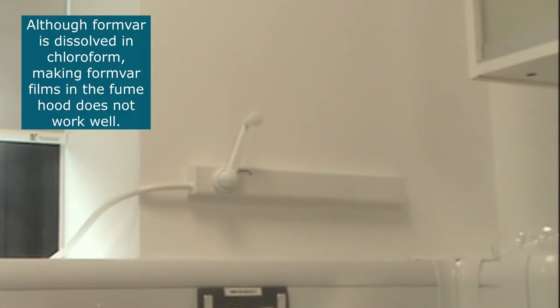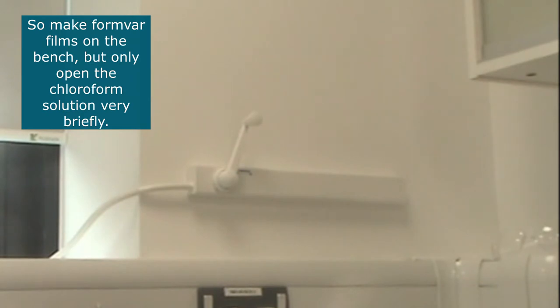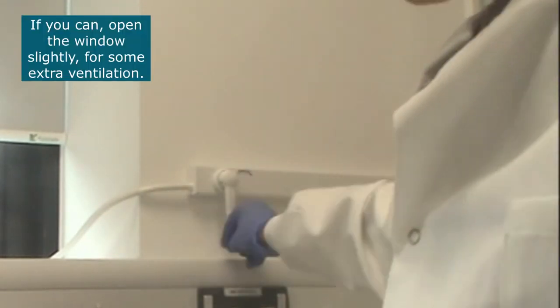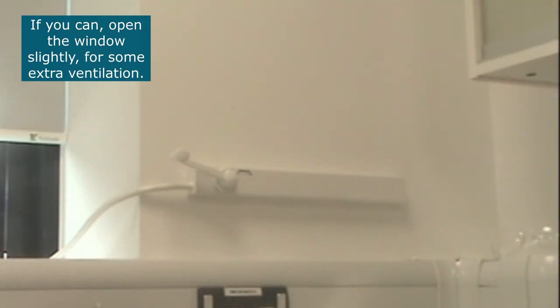Although formvar is dissolved in chloroform, making formvar films inside the hood doesn't work very well because of the flow of air inside the hood. So you will only open the chloroform solution very briefly on the bench, but if you can, open the window slightly so that you have a little bit of ventilation coming from outside while you're making the films.